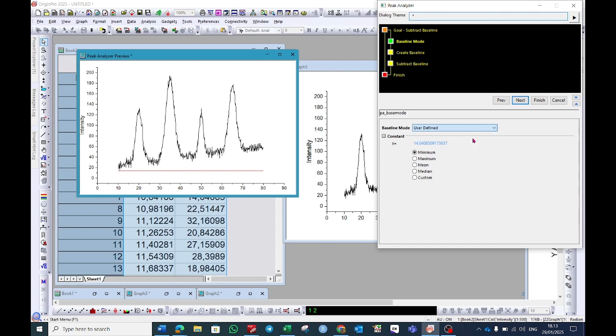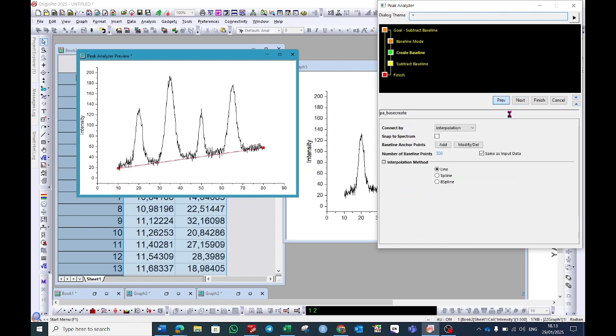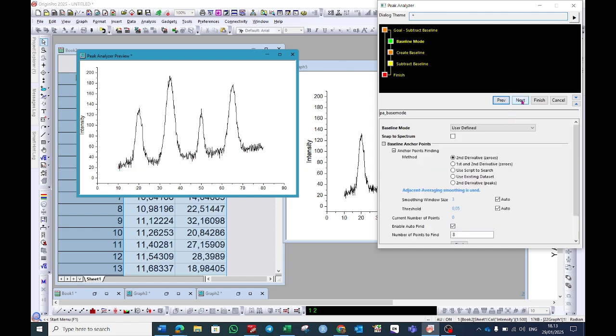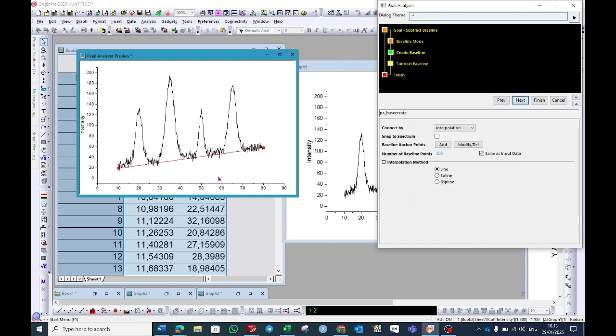So in the baseline mode select user define, and then click on next. A baseline correction is generated, but this is not what we want.